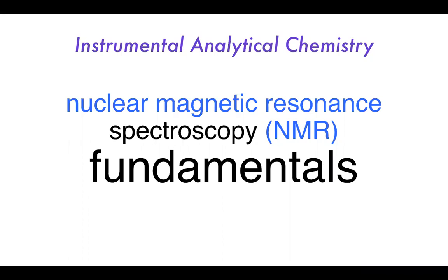A lot of very useful information there, especially about the individual environments of the different groups on the molecule, like maybe a CH3 methyl group, or a carbonyl group, or an oxygen here, a nitrogen there. We can pick those up on the FTIR and we can see how their interactions change with their environment. Like we could change the solvent, we could see how the peaks change, things like that.